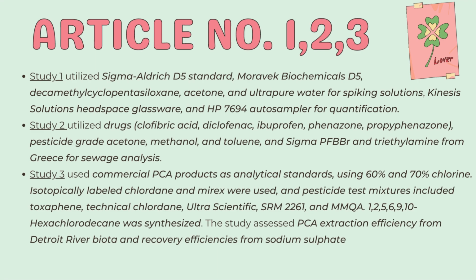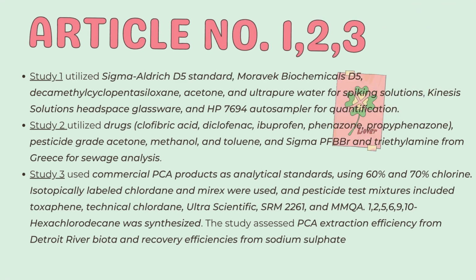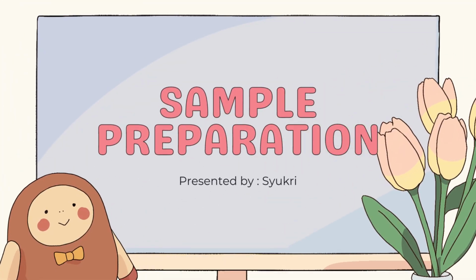The study evaluates the extraction efficiency of PCA from Detroit River biota and the recovery efficiency from sodium sulfate.